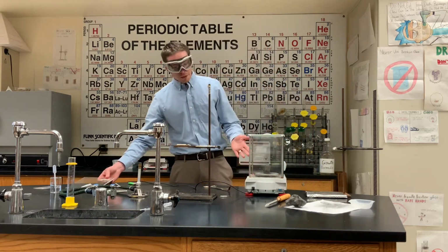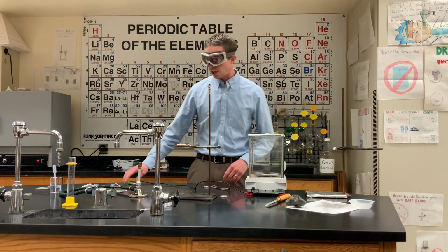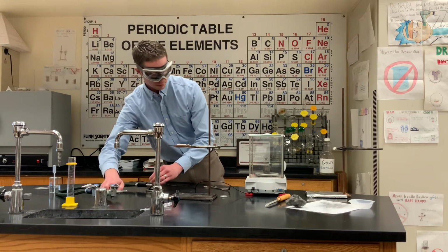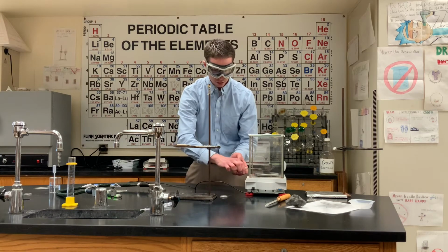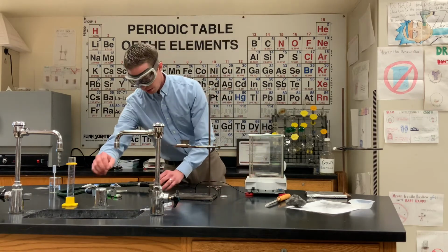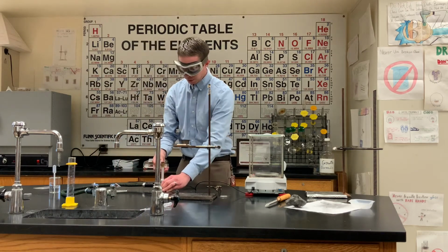So we could wait for that to oxidize on its own, but we would be waiting about 50 years for it to fully oxidize. Maybe not quite 50 years. We're going to help it along with a little bit of heat. So we're going to relight our Bunsen burner here. Actually, put the crucible back on the clay triangle first, and light our Bunsen burner as before.